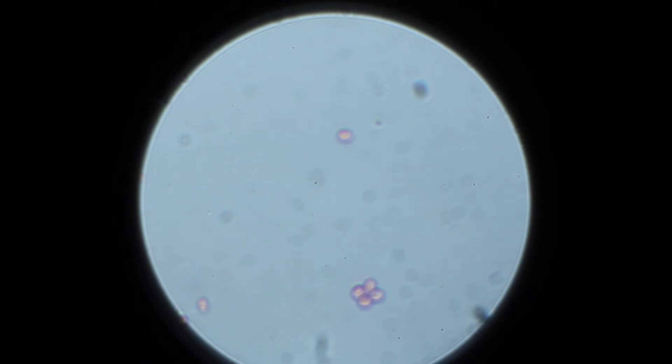That's at the top of the focus. Now we focus down. Starting to see some detail inside. Definitely seeing two big dark spots in the top one.